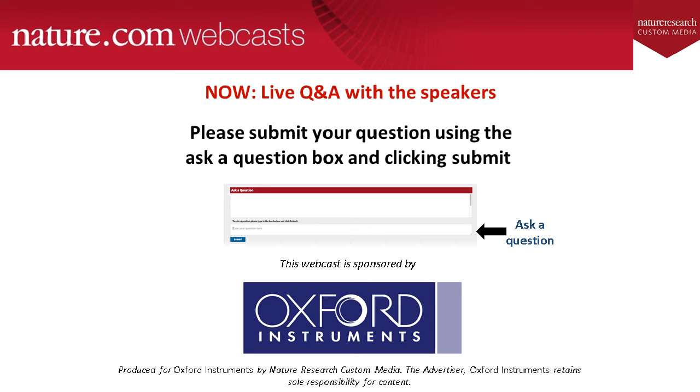Excellent. Thanks, Louise. Our next question asks, with thicker sections, how thick can one go? Do you lose any spatial resolution from the electron beam interaction volume? Louise, is that something you can help answer? Yeah, perfectly happy to answer that. I think the question depends whether it's TEM or SEM based. So with TEM, yes, you will lose resolution with thicker samples.